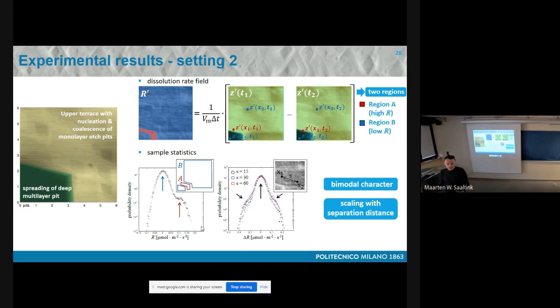The point is then to come up with an interpretive model which can take into account the transitioning of this distribution. Some people call it scaling of the distribution with the interval, with the increment, which means that you have a scaling of the mean. Sorry, the mean is always zero for the increment in this case.